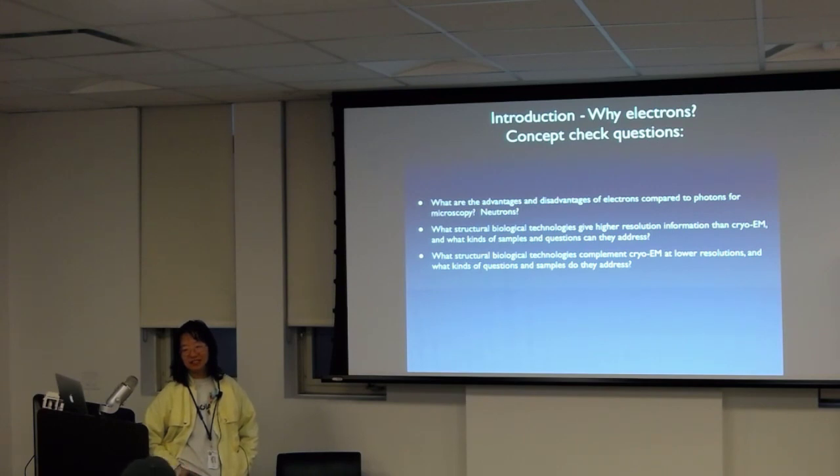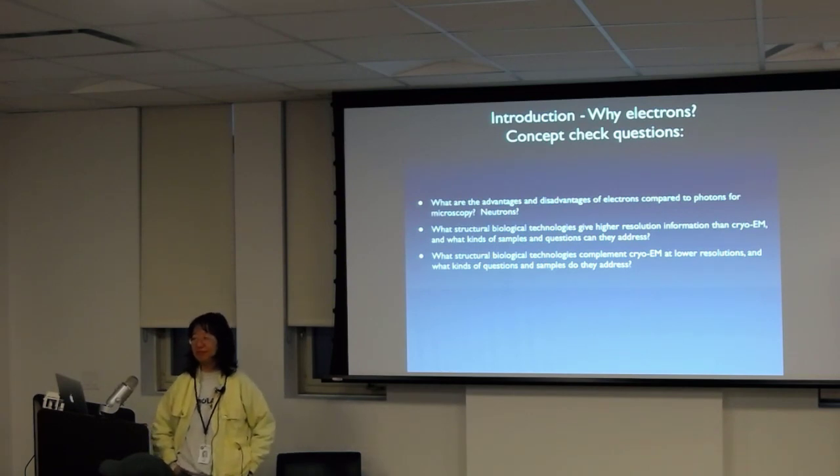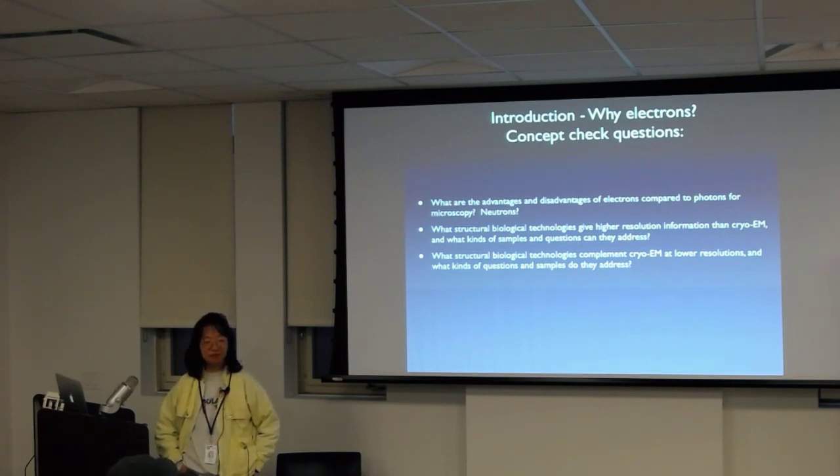So you can do neutron crystallography. It's very esoteric. There are also small niche things in crystallography. So serial femtosecond crystallography, XFEL. They're using a linear accelerator source.